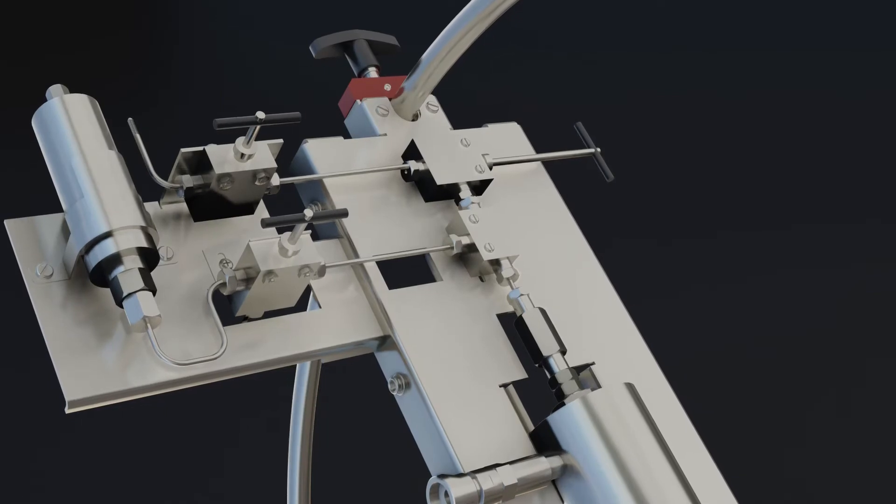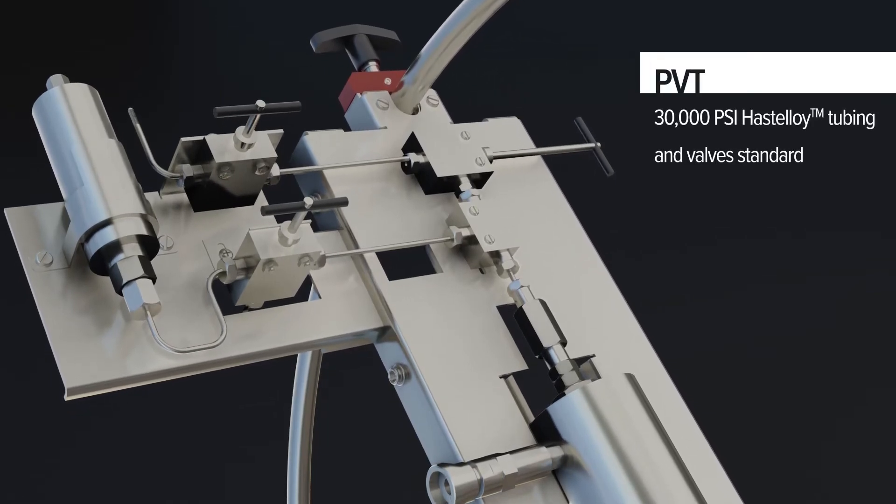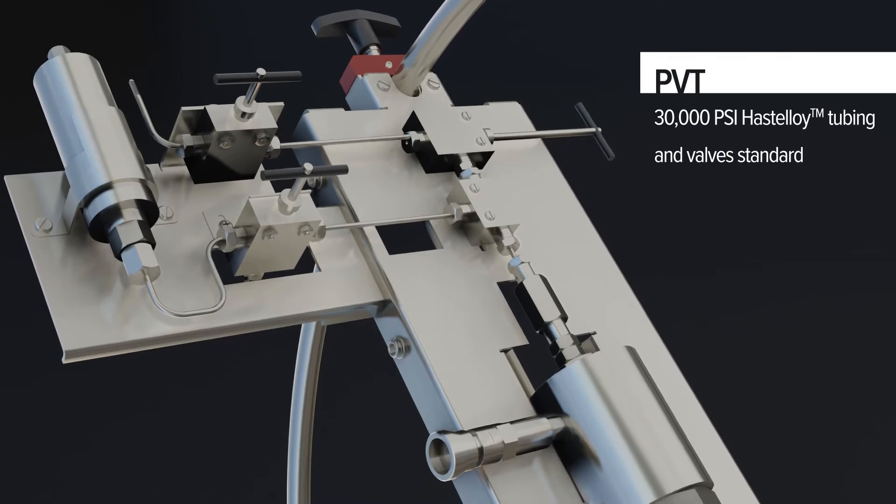Our sample conditioning platform incorporates all Inconel and Hastelloy wetted parts, including tubes and valves.